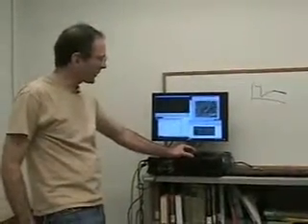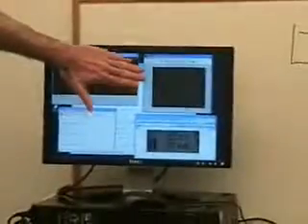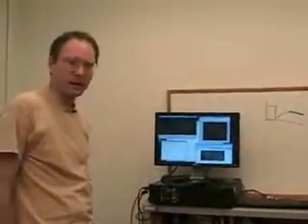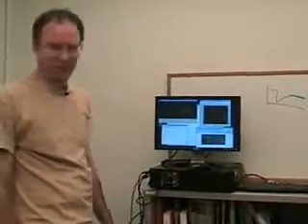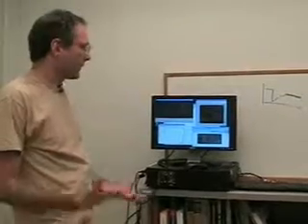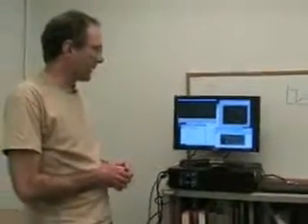Since everything's much darker now, I'm going to turn my gain way back up. And you'll see that even with my gain at maximum, I still have relatively little intensity here. It's still very hard to see anything. But the good thing is that the brightest things here will still be as bright as I can make them, and the darkest things will be as dark as the opacity of this box will allow. And that's the way that you want to do the camera settings.